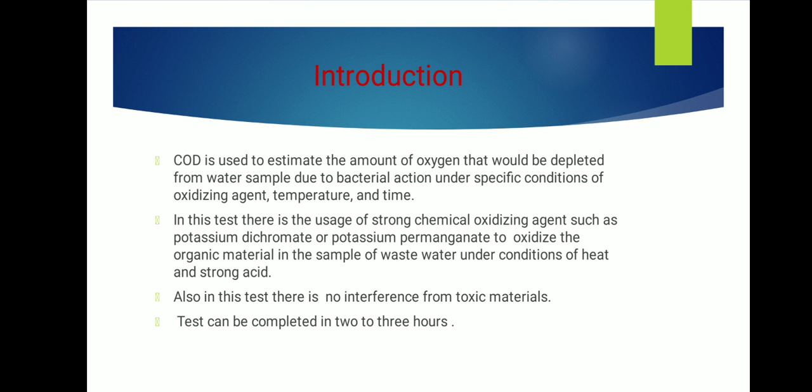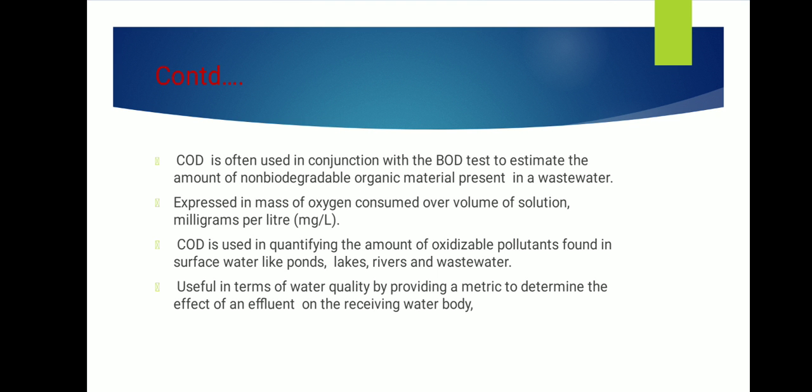Also, in this test, there is no interference from toxic materials. The test can be completed in 2 to 3 hours. COD is often used in conjunction with the BOD test to estimate the amount of non-biodegradable organic material present in the wastewater, and it is expressed in mass of oxygen consumed over volume of solution, that is milligrams per liter.